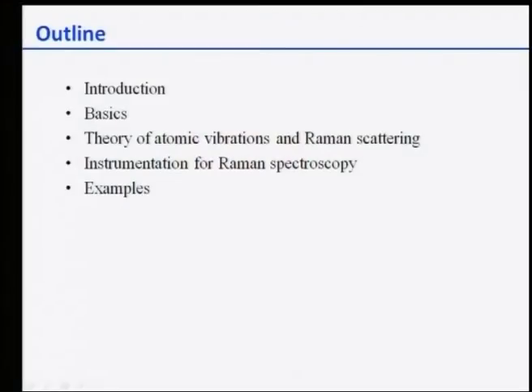As you know, the outline is like this. Obviously, there will be some aspect of introduction going back to history and some basic features, and then I will talk about some basics of the Raman spectroscopy, where I will talk about theories, and then some amount of scattering and vibrations, and finally some instrumentation for Raman spectroscopy. Now, obviously, during the course of the lecture, I am going to talk about some examples from the literature and from some of our own work.